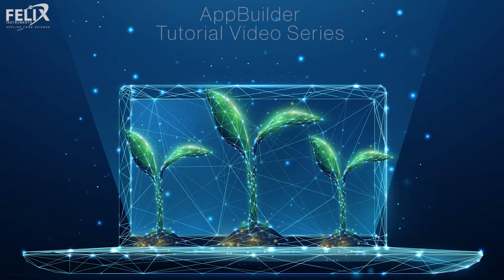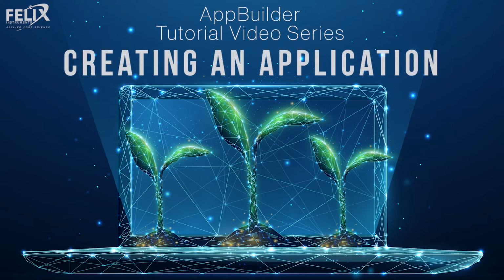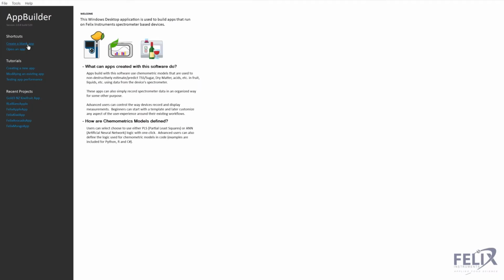Hello, and welcome to the Felix Instruments AppBuilder video tutorial on how to create an application. This video will demonstrate the general workflow for creating an application from scratch. The very first thing I'm going to do is open AppBuilder, and then I will create a blank application by either clicking the shortcut link or by going to File, New Project.